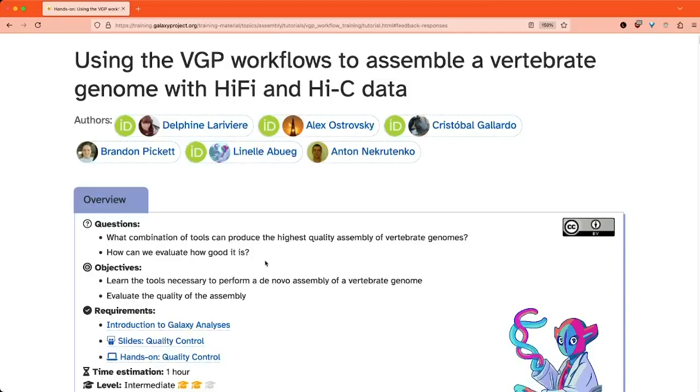This tutorial is one of two that VGP has available on the GTN. This one is the workflow-focused one. The other is the long-form tutorial, which isn't covered here but will be referenced during the video. It's worth taking a look at it before starting because there are some definitions useful to know, and it goes very in-depth and step-by-step through the assembly process, covering different parameters and choices made throughout the pipeline.